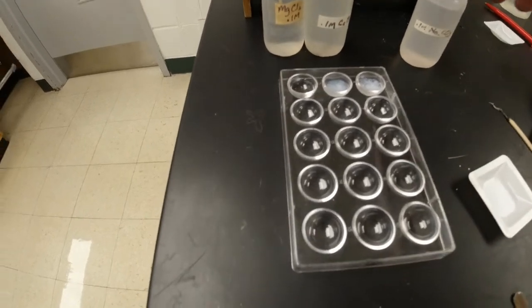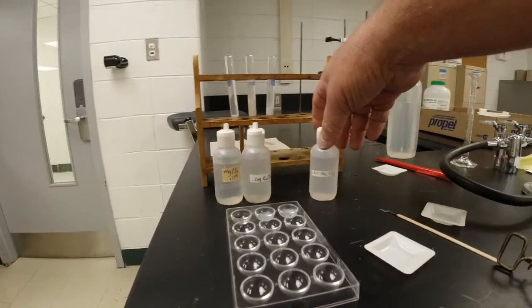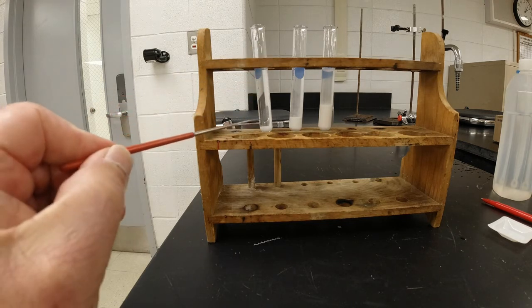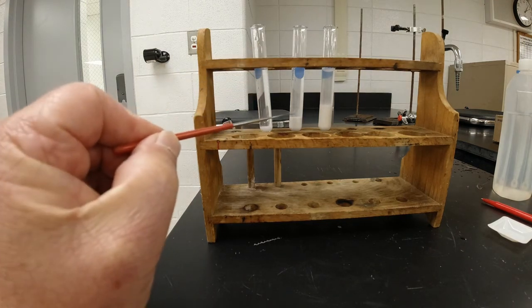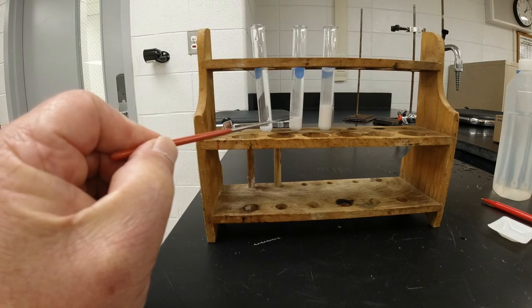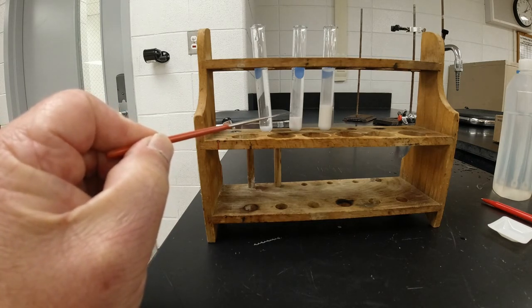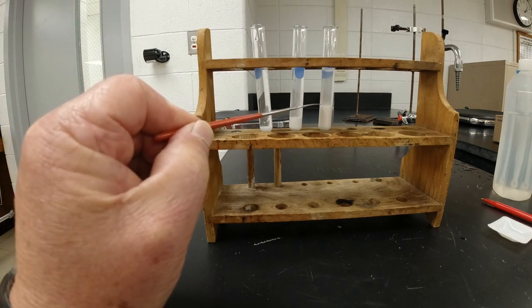Okay. Now let's go back and let's look at our solutions. All right, and so we're going back. We're going to look at our final solutions here. If I look at these, this is the one I put the magnesium sulfate in. Almost all of it dissolved. If I look at the next one, the calcium sulfate, it's in the middle. And the barium sulfate, it was the least soluble.